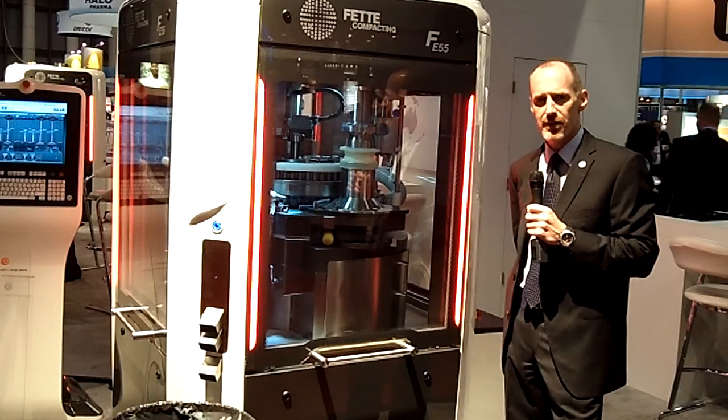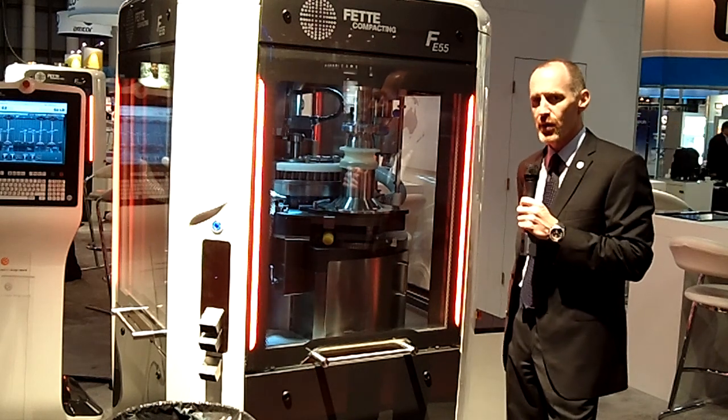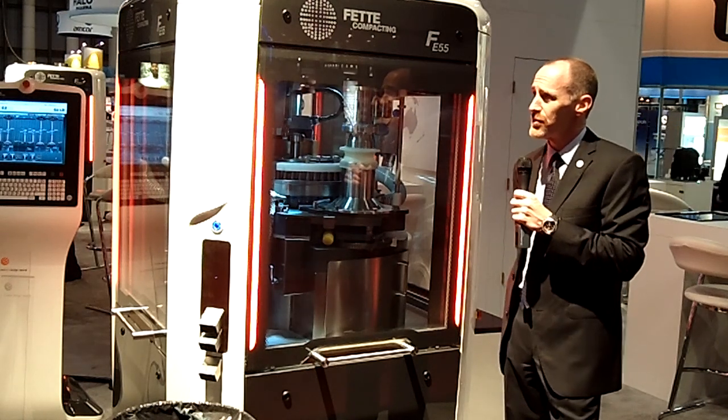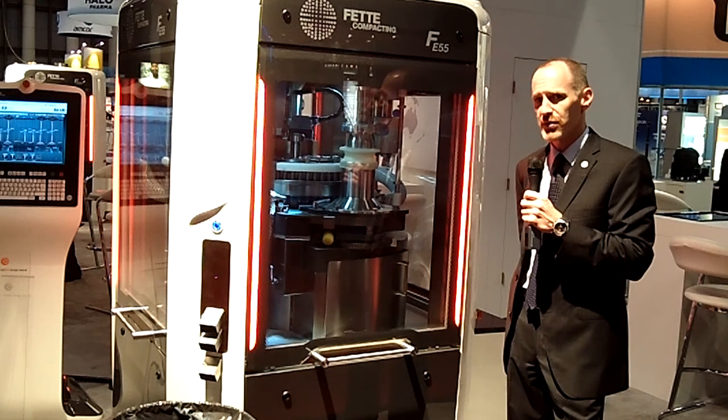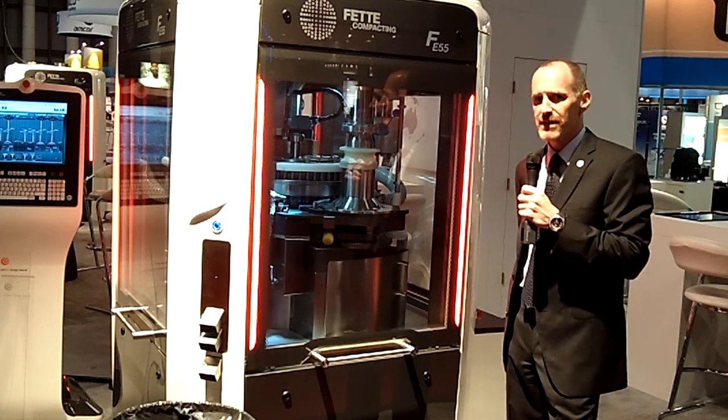Morning, everybody. My name is Matt Bundenthal. I work with Fette Compacting America, and I'm going to give you a very brief introduction to Fette Compacting's newest and most innovative single-sided tablet press, the FE55.